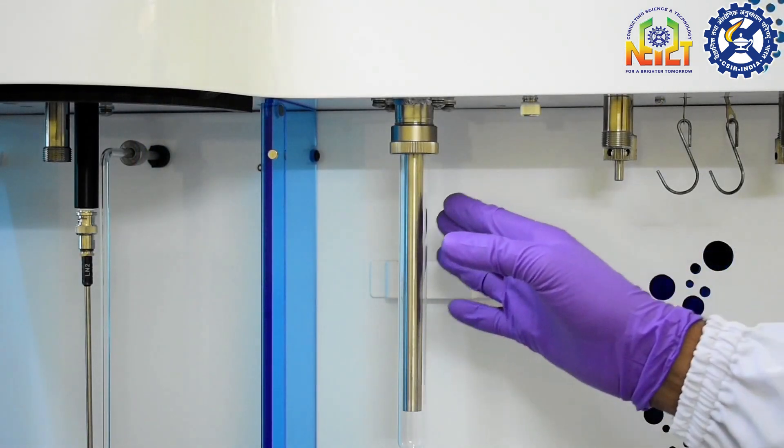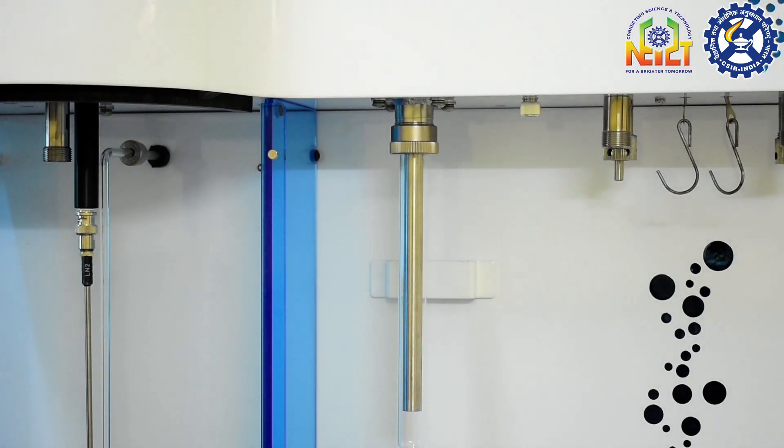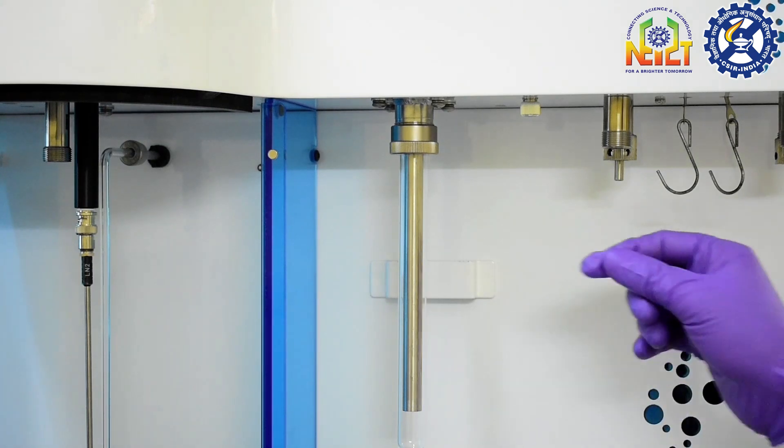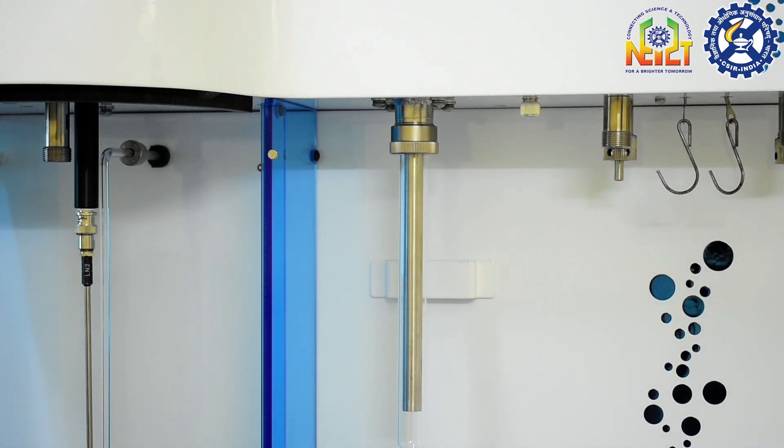A cold trap is used to permit continued removal of condensable products of degassing even when heated samples are not connected to active vacuum. And it also prevents diffusion of condensable vapors into the degas manifold.